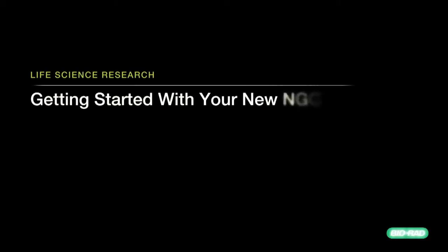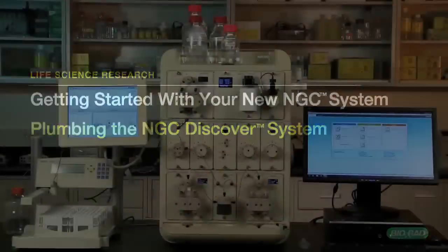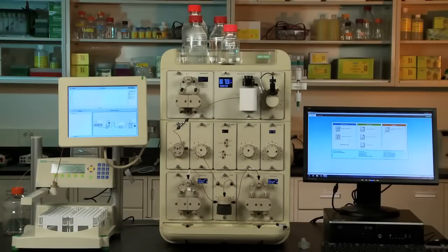This video shows how to install plumbing on a new NGC Discover 10 or Discover 100 system. When installing plumbing, tighten all fittings into their ports.